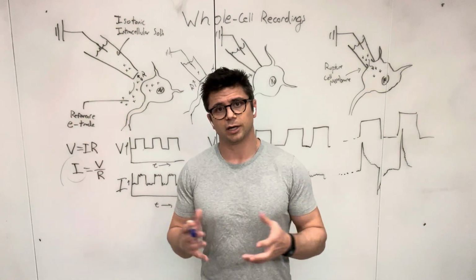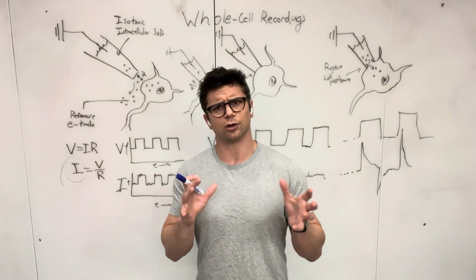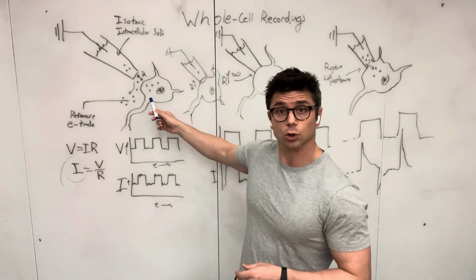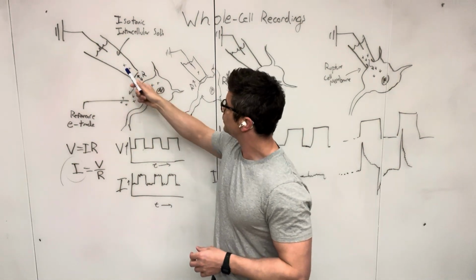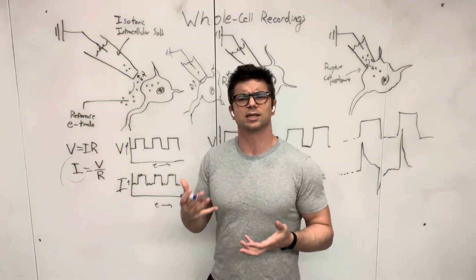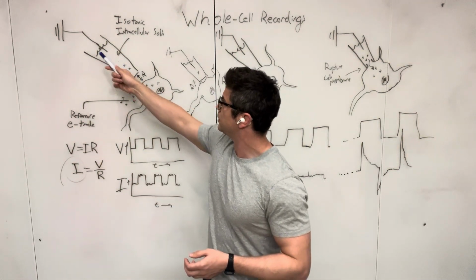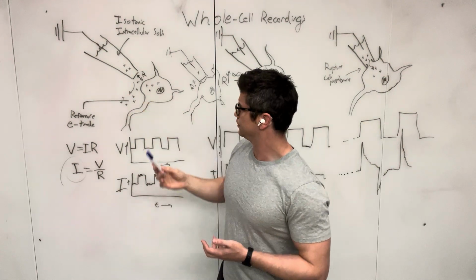So I'm going to talk a little bit about recording single neurons in a specific technique called whole cell neuron recordings. All right. So to do this, let's say there's a neuron you want to record. You have a glass micropipette filled with an isotonic intracellular solution, a solution that's similar to the internal composition of a neuron. In that glass pipette, you have a recording electrode, and there's also a reference electrode in your solution.